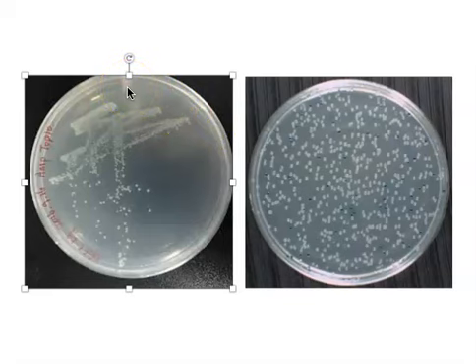The loop is then sterilized. We place it onto the plate, drag it through that quadrant, and streak it out again a third time, and again a fourth time. The purpose, again, of making this kind of a plate is to try to produce individual colonies that we can evaluate for morphology.